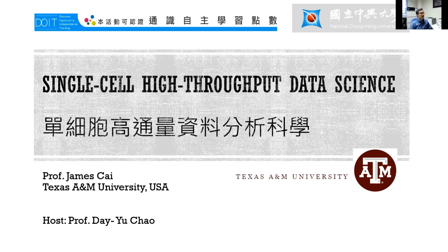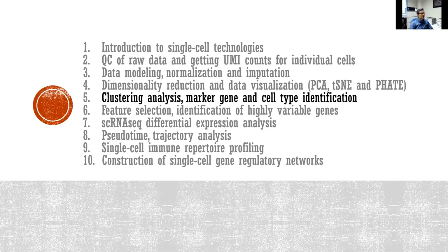Hello, welcome to our lecture number 5 on single-cell high-throughput data science. In this lecture, we are going to cover clustering analysis and its application in single-cell RNA-seq analysis.